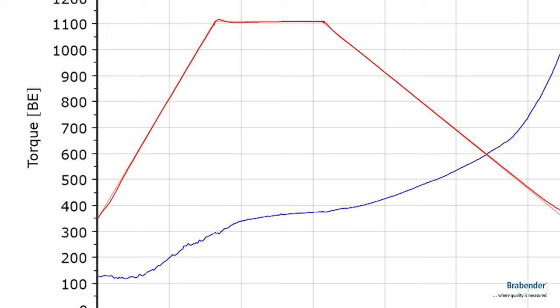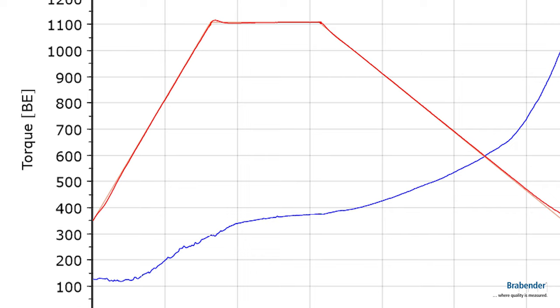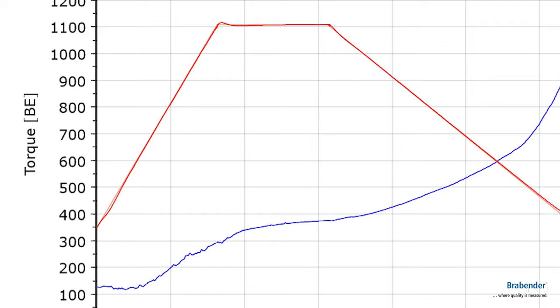In the first part, we are heating our seaweed from about 30 degrees Celsius to a high temperature. During this time, the seaweed is hydrating and swelling, which can be seen due to increasing torque.